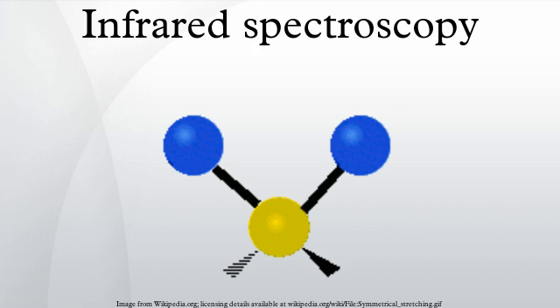For a given sample, which may be solid, liquid, or gaseous, the technique of infrared spectroscopy uses an instrument called an infrared spectrometer to produce an infrared spectrum. A basic IR spectrum is essentially a graph of infrared light absorbance on the vertical axis versus frequency or wavelength on the horizontal axis.